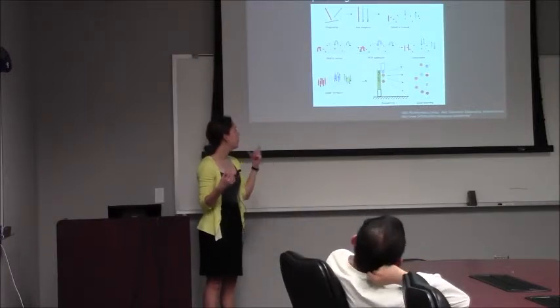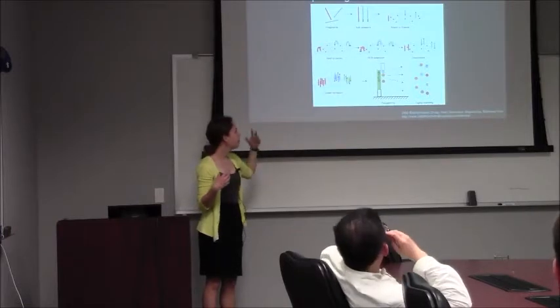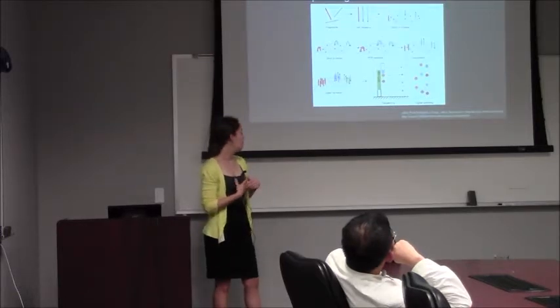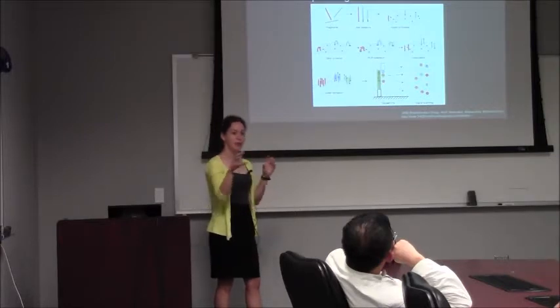And once it has a location, you can go through this duplication procedure to get a lot of them because genetic material is small. And then once you have that, you have these clusters of each fragment.